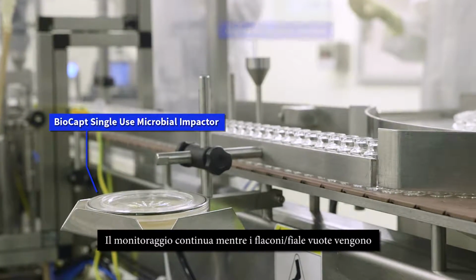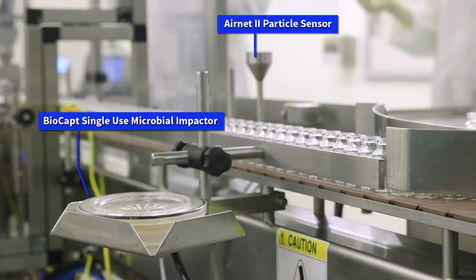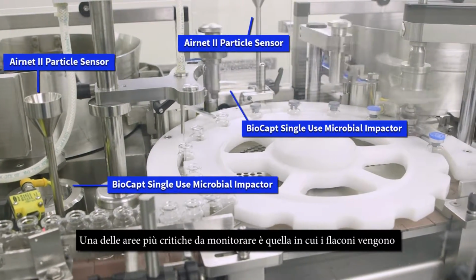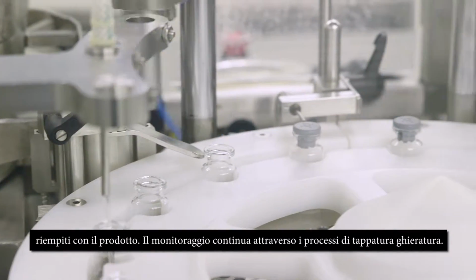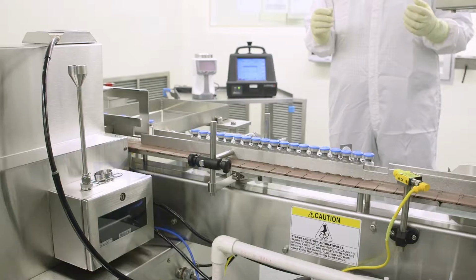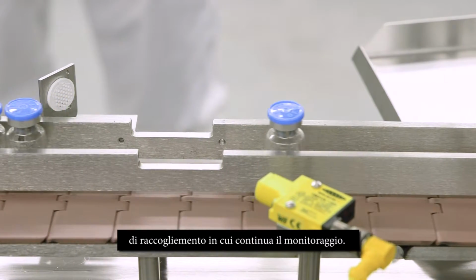Monitoring continues while the empty vials are transported to the filling operation. One of the most critical areas to monitor is where the vial is filled with the product. Monitoring the filling process continues through the stoppering and capping steps. Once the vials are capped, they are conveyed to a collection area where monitoring continues.